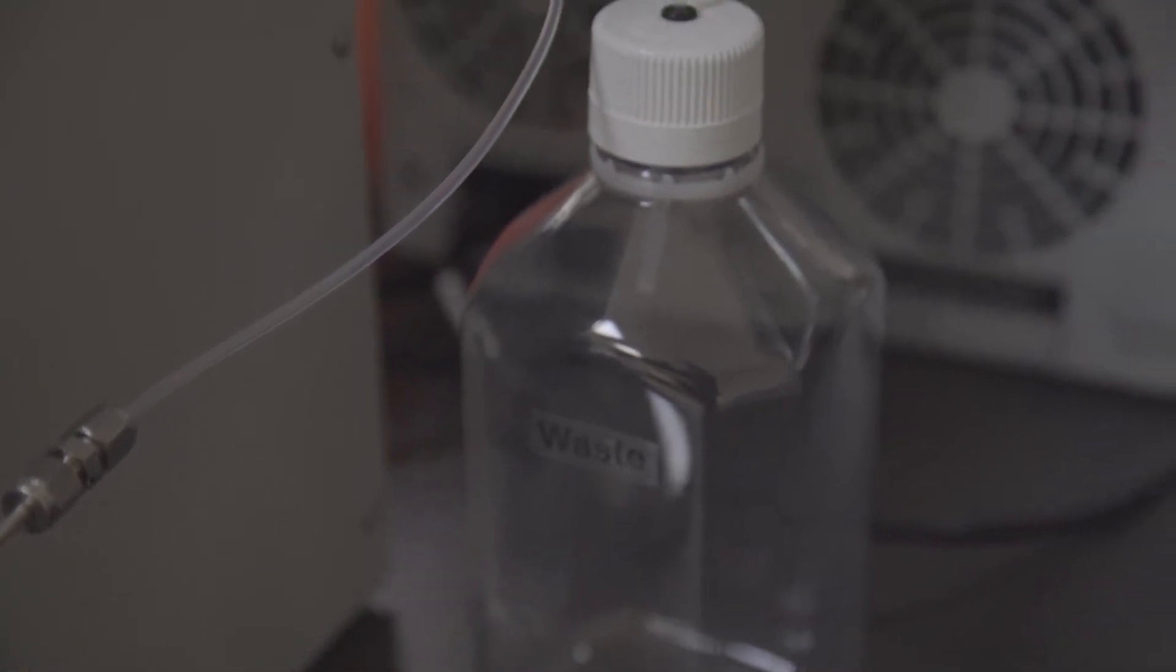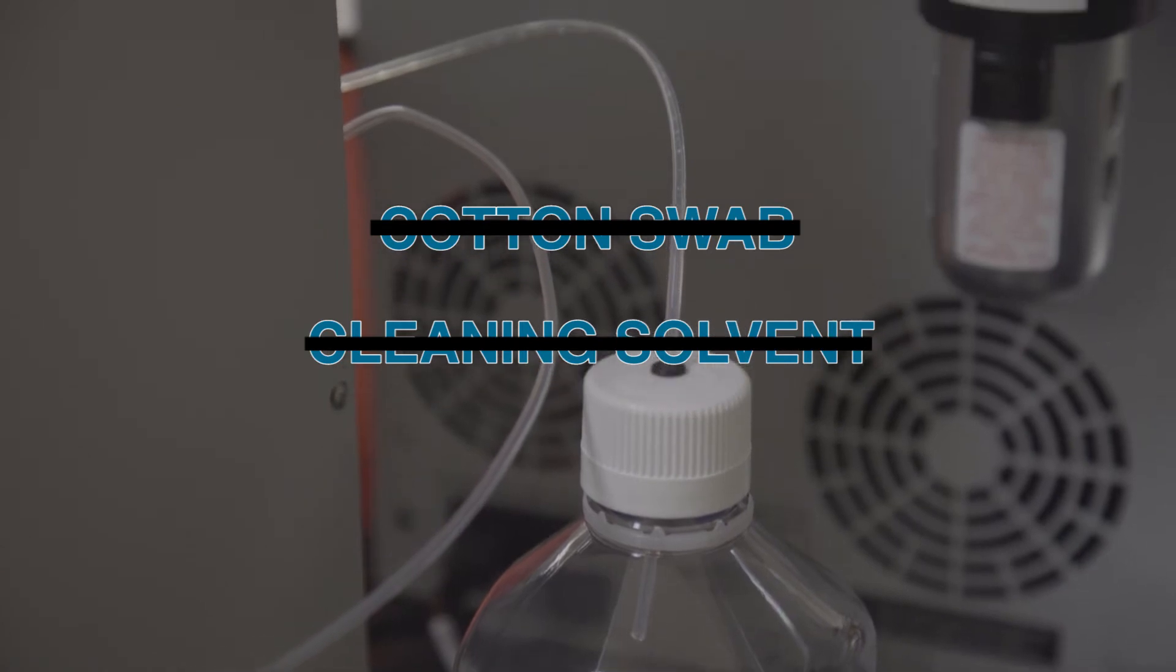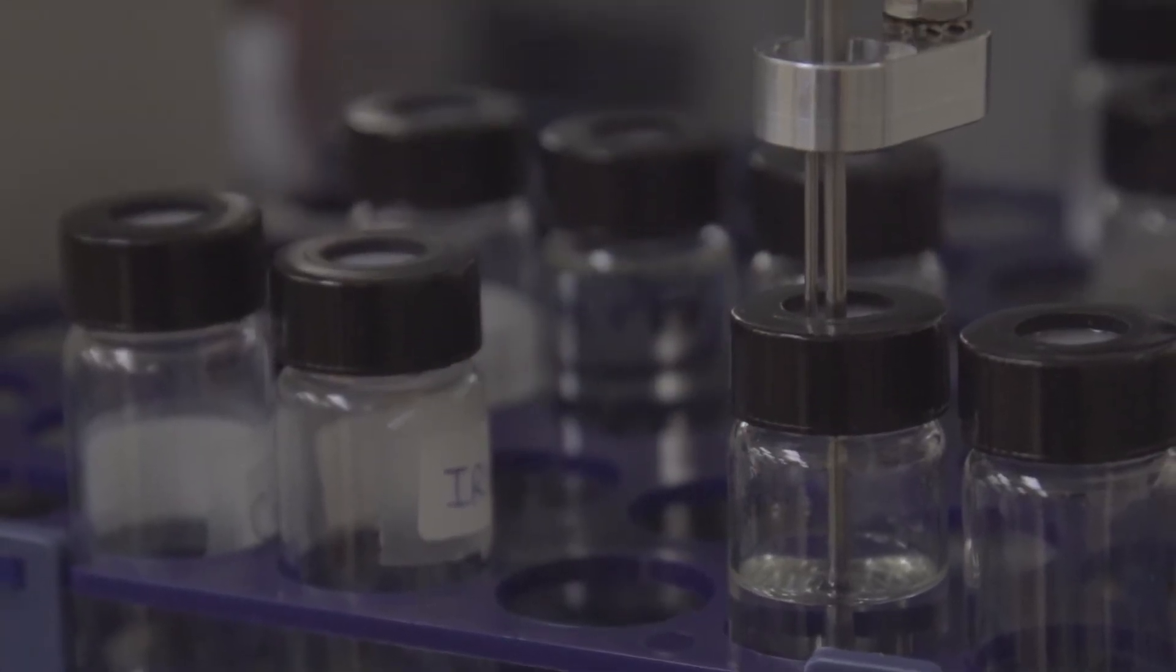The JFA 70XI has an automatic self-cleaning cycle that rinses and disposes of the remaining sample. No cotton swab is needed, no cleaning solvent. It saves you time and ensures perfect cleaning.